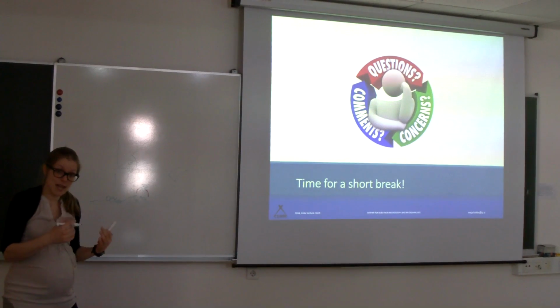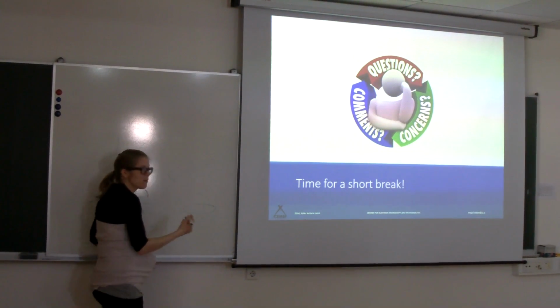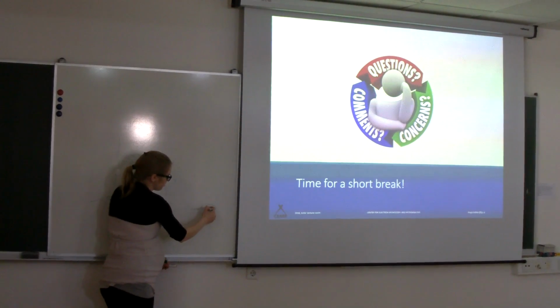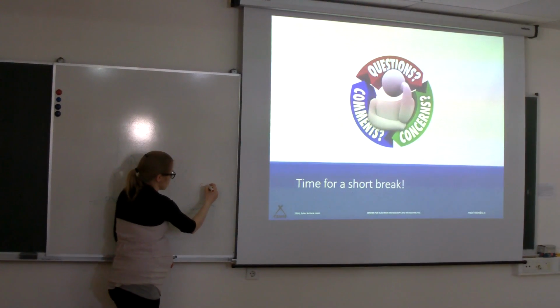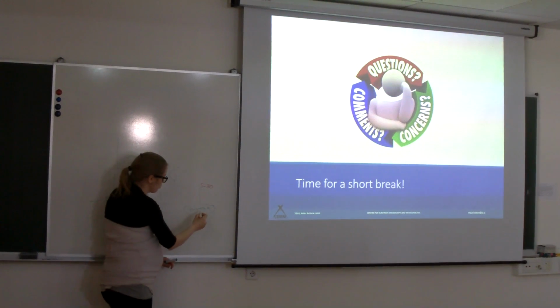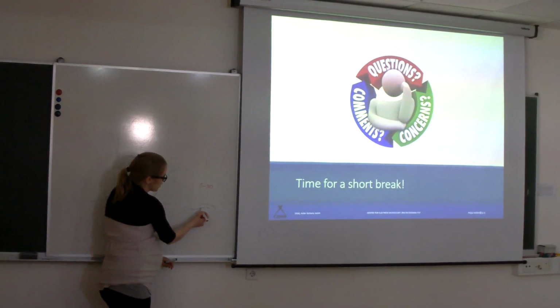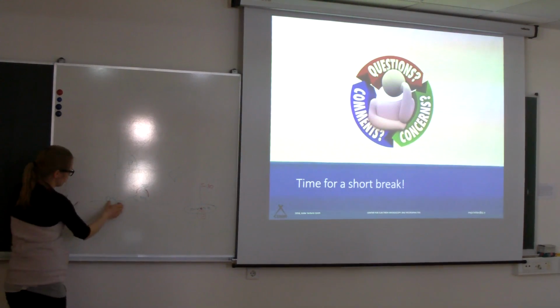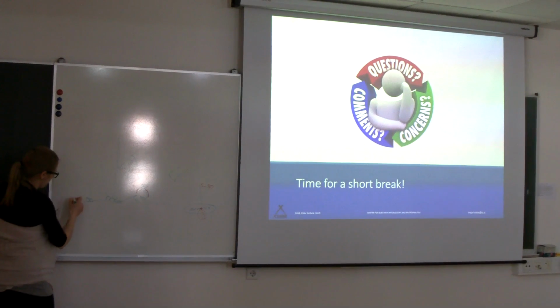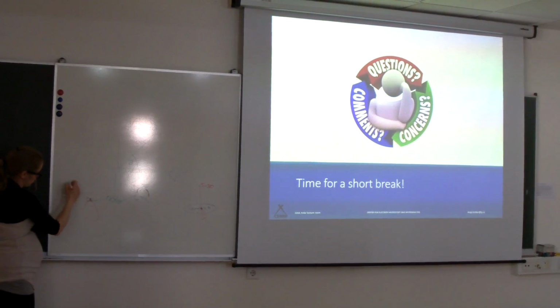A better way is to go on the STEM, because you will put particles on carbon. So not STEM in a TEM, but STEM on the SEM. You put particles on the grid, and you don't have high energies. You have the same as in SEM, so the interaction volume will be the same, but you won't get anything from the substrate. If you have small particles, you only get a small amount of X-rays depending on what's underneath, and that's also a problem. Also, if you have two particles, or a bunch of them, this could be a problem, because of the amount of X-rays from your sample and the amount of X-rays from the substrate.